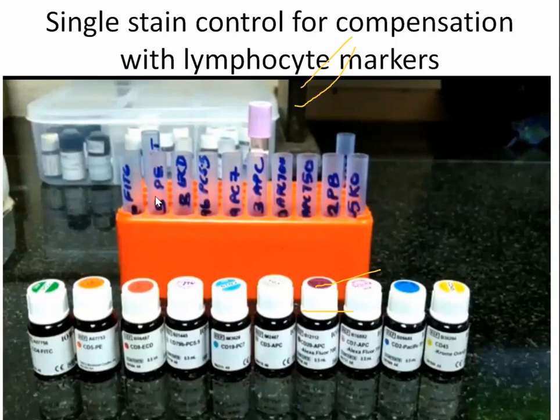Again, I need to check all the channels for signal. Ideally, only in the PE channel there should be a positive signal. All other channels should not show a positive signal. If there is a positive signal in other channels other than PE, then you need to compensate. So you run them one by one, compensate, and finally, once you finish all the 10 fluorochromes, you have done adequate compensation. This is how compensation is done with controls.